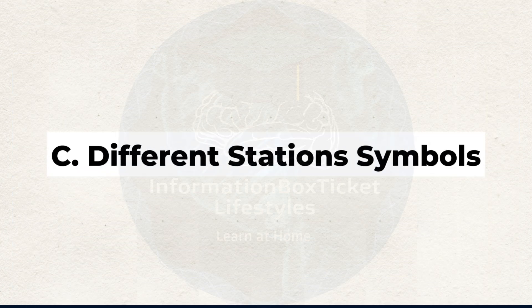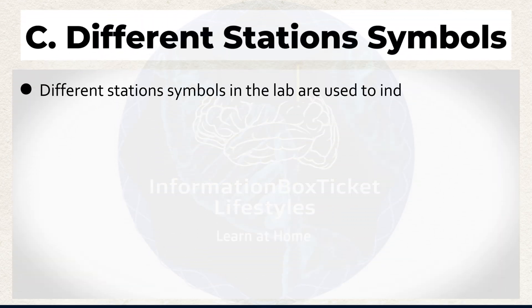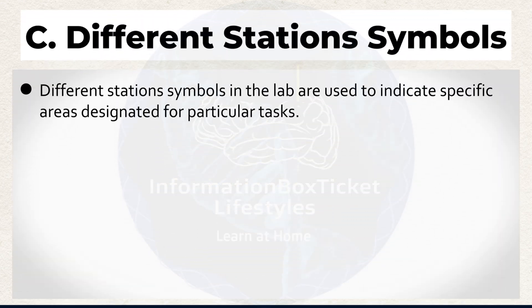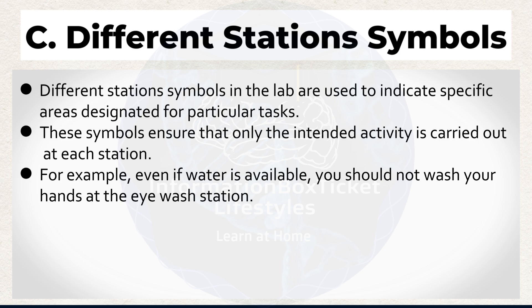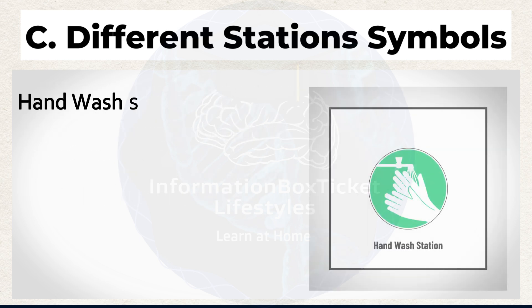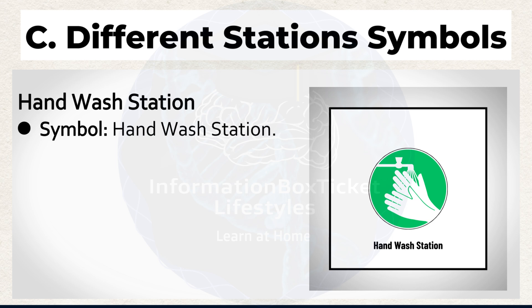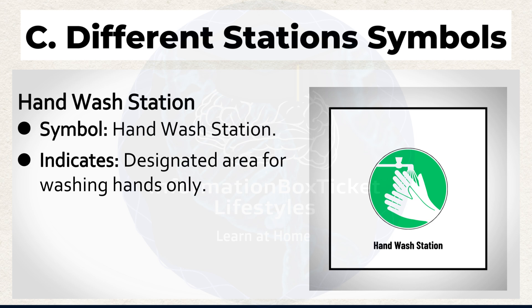C. Different station symbols in the lab are used to indicate specific areas designated for particular tasks. These symbols ensure that only the intended activity is carried out at each station. For example, even if water is available, you should not wash your hands at the eyewash station. Hand Wash Station symbol indicates the designated area for washing hands only.